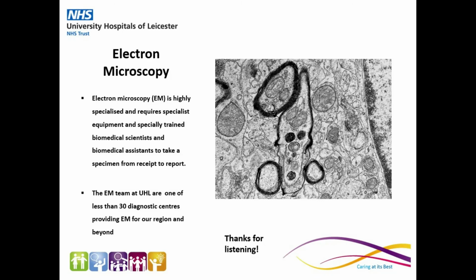Electron microscopy is a highly specialised technique requiring specialist equipment and trained biomedical scientists and biomedical assistants. We look at a variety of tissue types and are one of the largest diagnostic centres out of less than 30 in the UK.